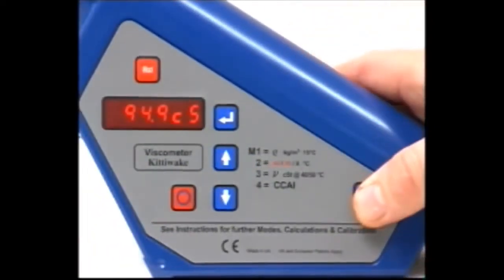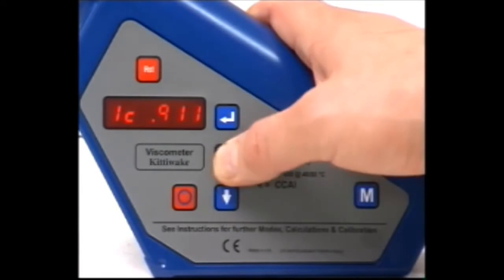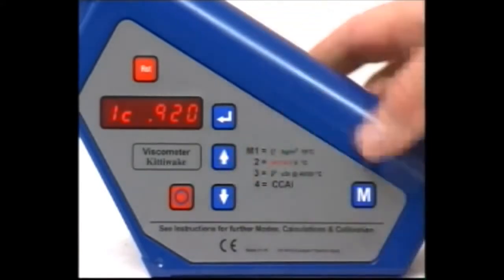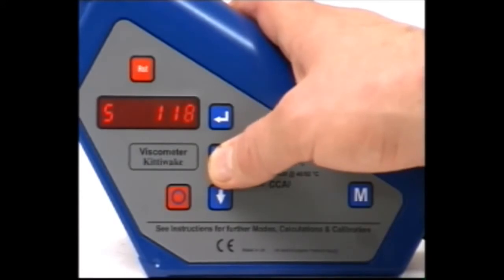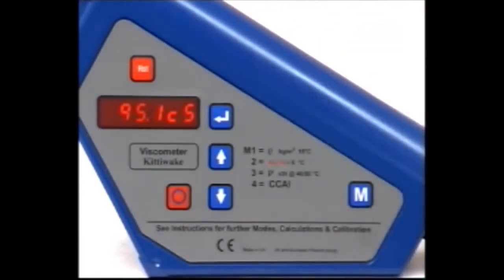For unheated operation with multigrade or synthetic oils, follow the basic procedure for readings at 40 degrees. Then select Mode 1 and enter the figure for corrected oil density. The default setting used is 0.9. Select Mode 5 and enter the viscosity index figure. The default here is 100. Press Return to recalculate centistokes at 40 degrees Celsius.